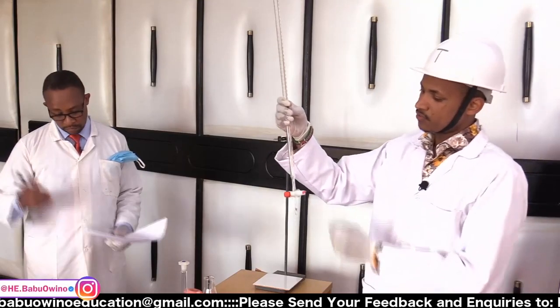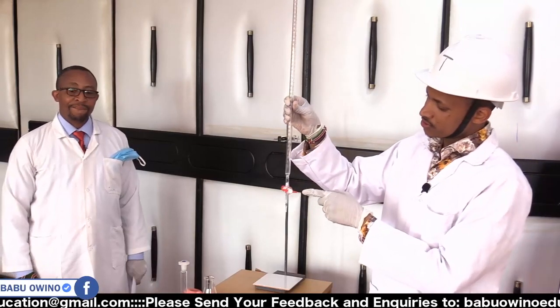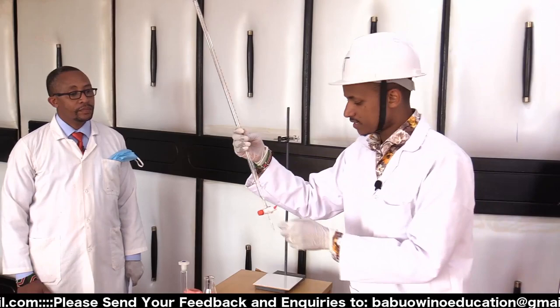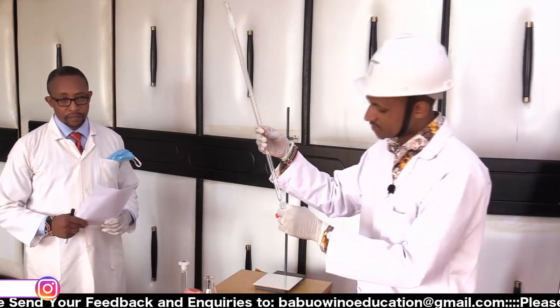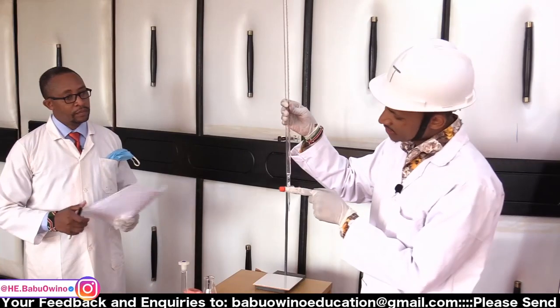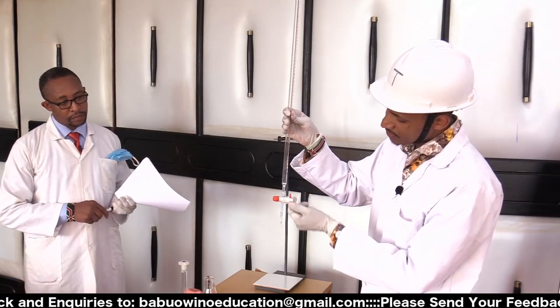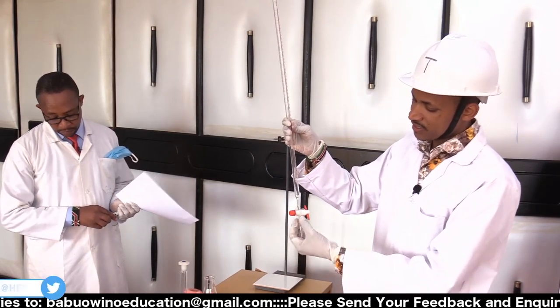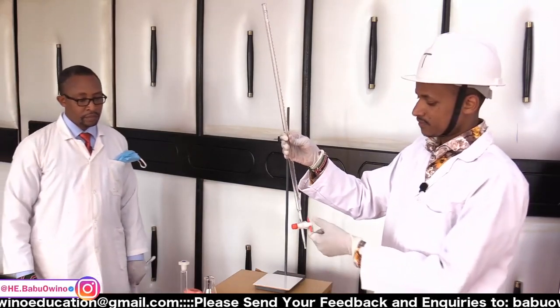When you fill this burette, the solution in the burette is called the titrant. The titrant here will reach this level of the tap. So you release it a little bit, you open the tap. When you open the tap, you shall have released part of the chemical so that the burette is filled. Then you close it.